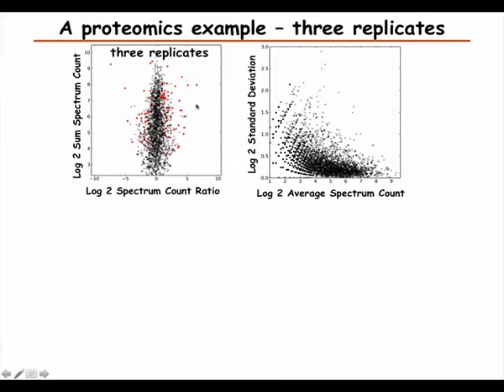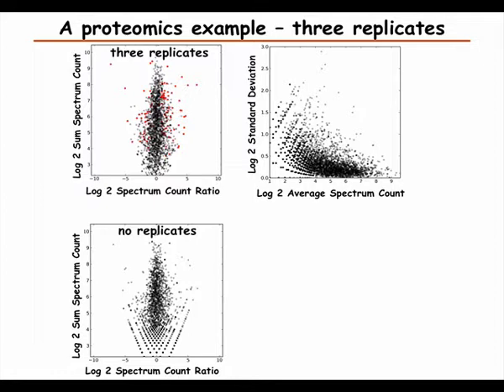So the one where we make the assumption about the distribution and look for outliers is definitely a very dangerous thing, especially since if we compare it, now this is just picking one pair of replicates from these 3. We see that we have a much wider distribution, and definitely if we would have just picked outliers, we would have gotten a lot of them right, but maybe half of them wrong or something like that. So quite a lot. So it's definitely not advisable to not do replicate measurements. But the problem is that sometimes it's expensive, it takes time, so people try to avoid doing it.